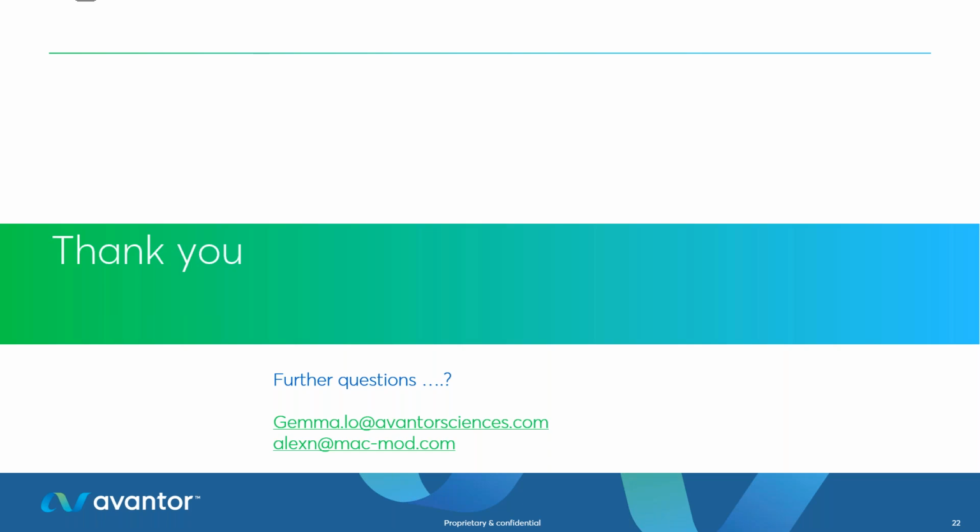So first question, can I use acetonitrile with a PFP column? Great question. And you probably saw some examples of us using acetonitrile with a PFP column through the presentation. There is some press and some information talking about suppression of pi-pi interactions when you use acetonitrile.